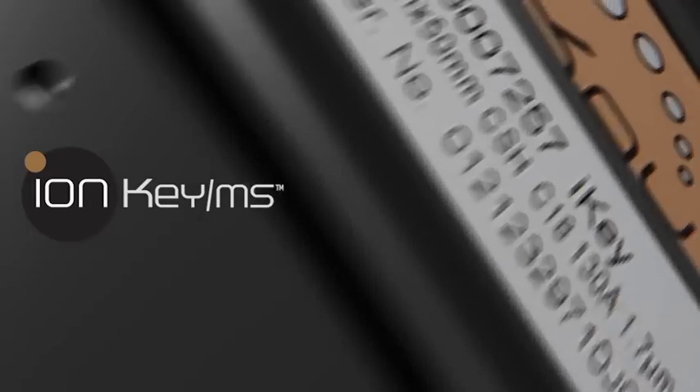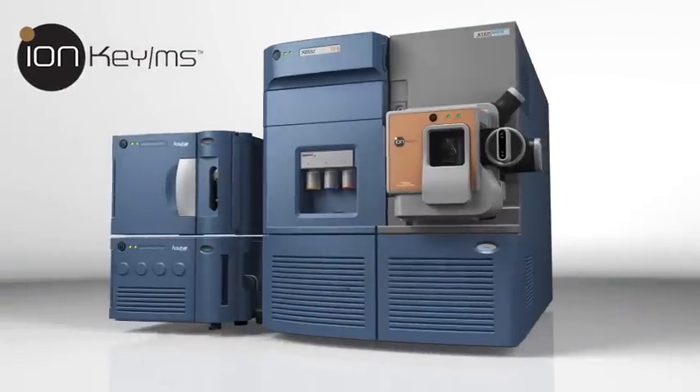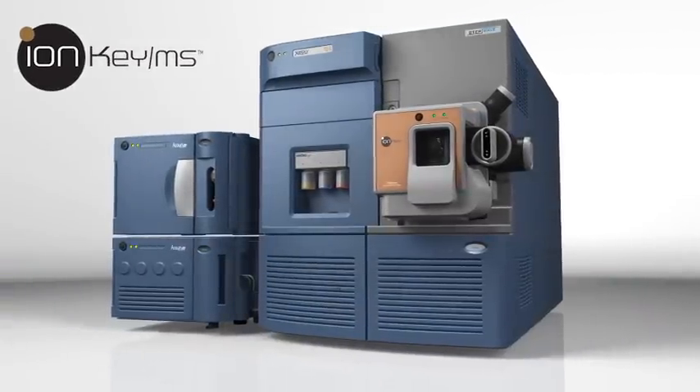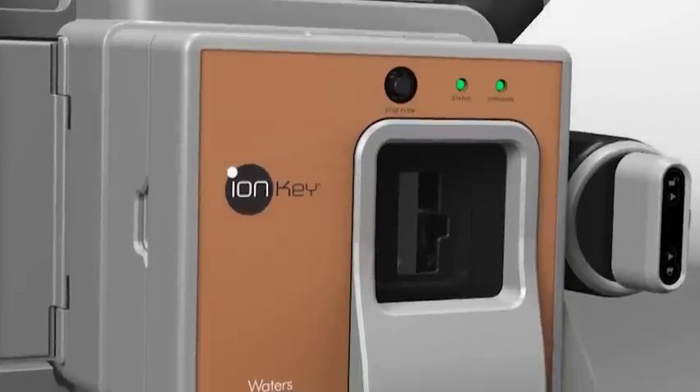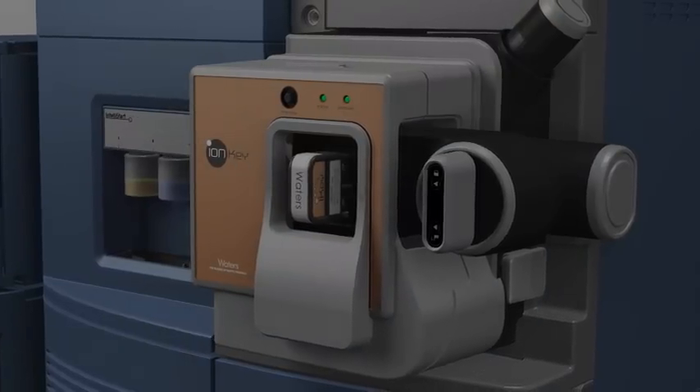The IonKey MS system integrates the UPLC separation into the source of your Waters mass spectrometer, delivering a level of performance and ease of use that simply cannot be achieved any other way.